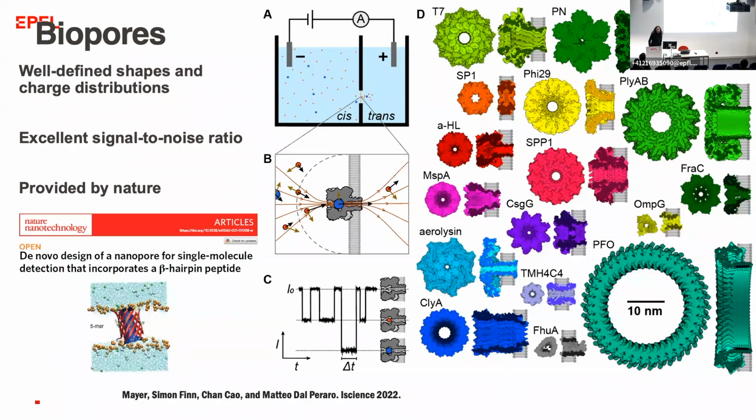There is also great effort from the community that looks at protein design, and I think that's an area that one needs to keep an eye on, as it is the way that one can engineer a pore that has the properties one would like to have. But it's still really in its infancy. At the moment, what the nanopore community does is take these biological pores and mutate a few amino acids in order to change surface charges and to provide better sensitivity.